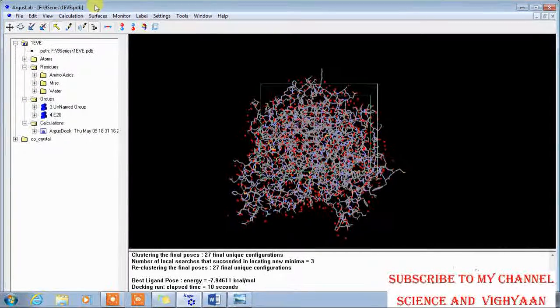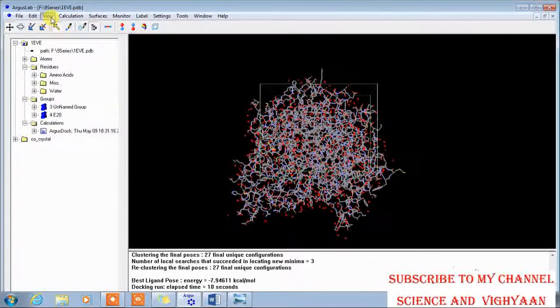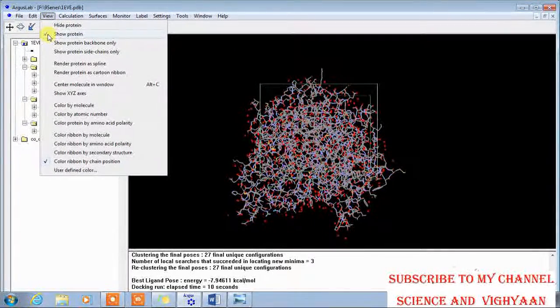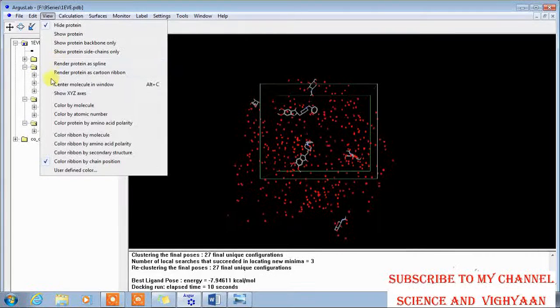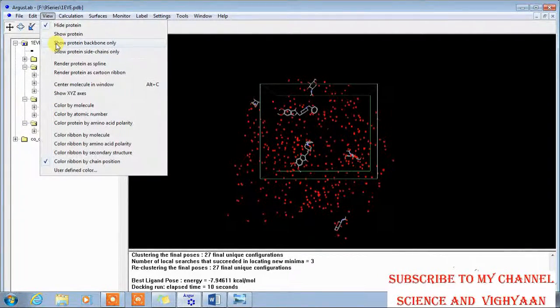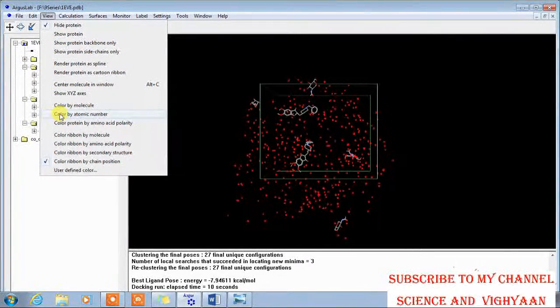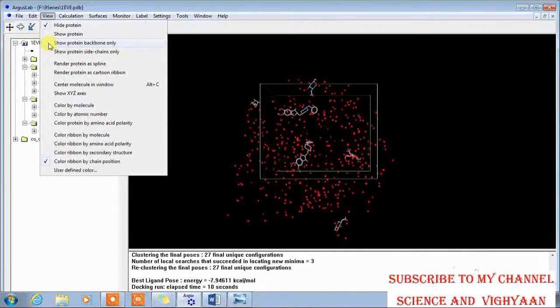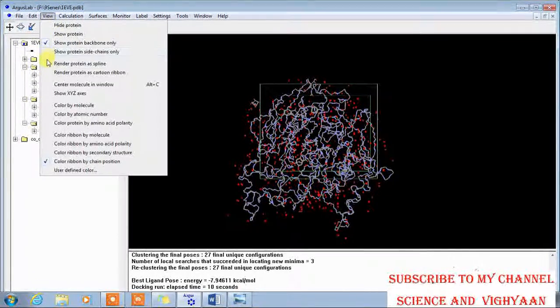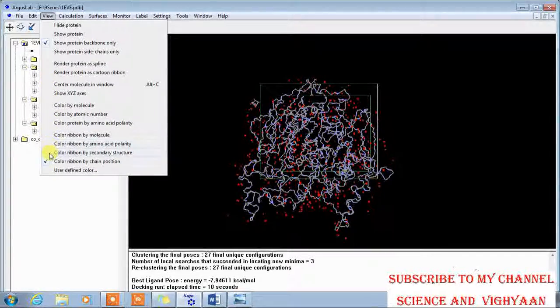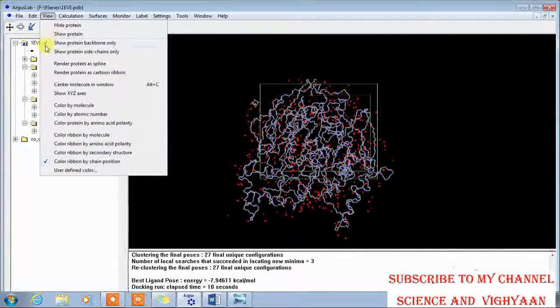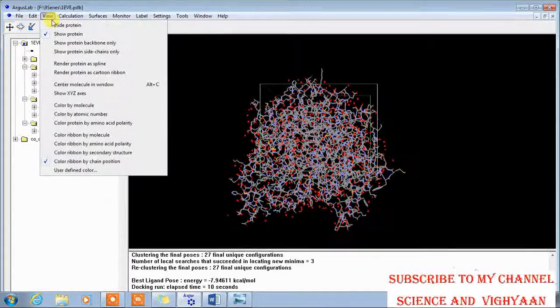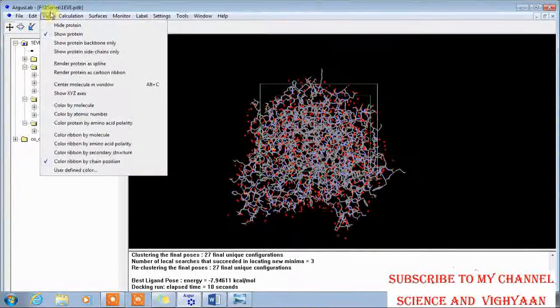For this just you should go to the view here, unclick this one and go to the show protein backbone, or you can select the structure from here.